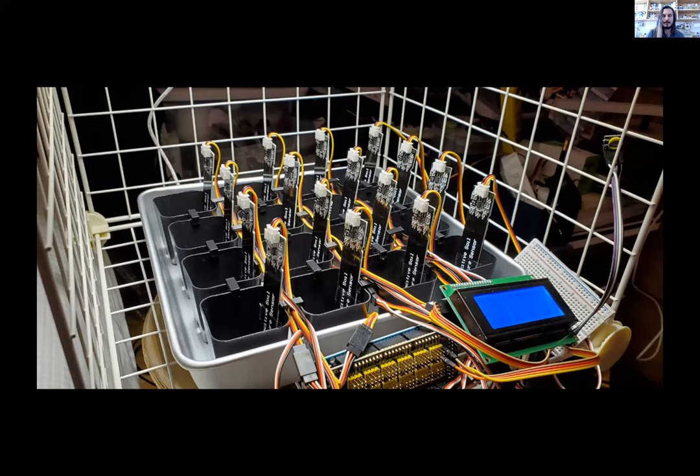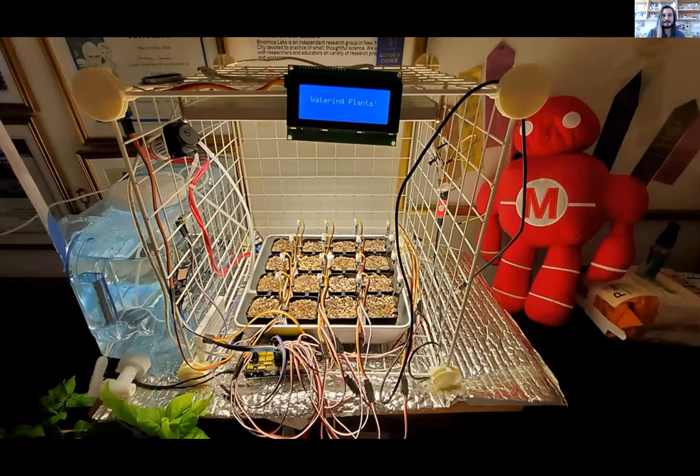and then turns on a watering pump when it's necessary. And it maintains humidity and temperature, and it logs it to an SD card. It measures humidity, temperature, the changes in that, and then the health of the sensors, because you're comparing it to where it was when you first started, in case there's sensor degradation. It doesn't need to be this complicated, but I've had about 14 generations now with this Cabbage Babbage system, and it's been wonderful. That entire water tank holds enough water to go 1 week above an entire growth cycle.